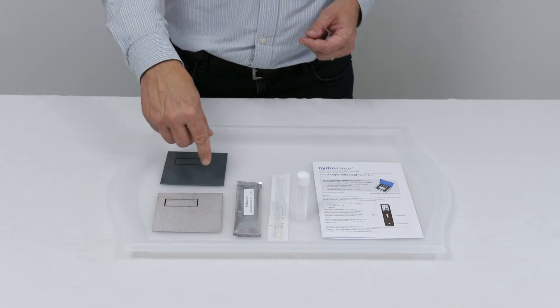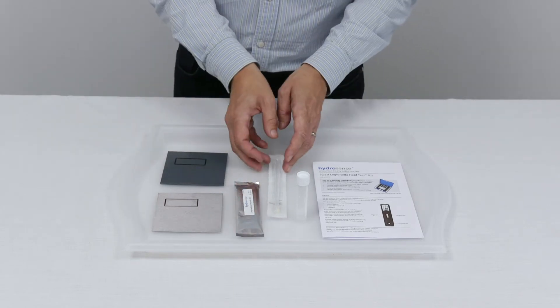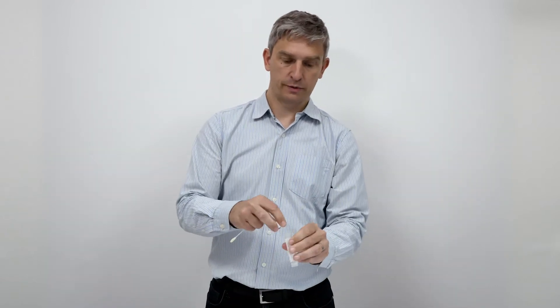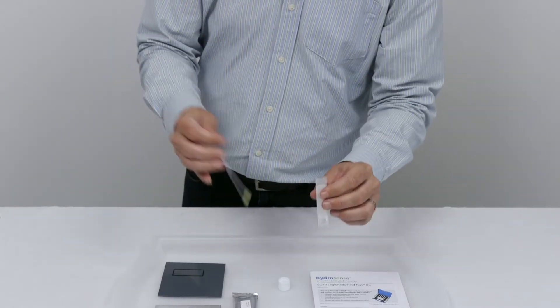If your surface is dry, then you should pre-moisten the swab. To do that, remove the swab from its packaging, open the vial containing the buffer, dip the swab in, remove the excess liquid, and then swab your area.